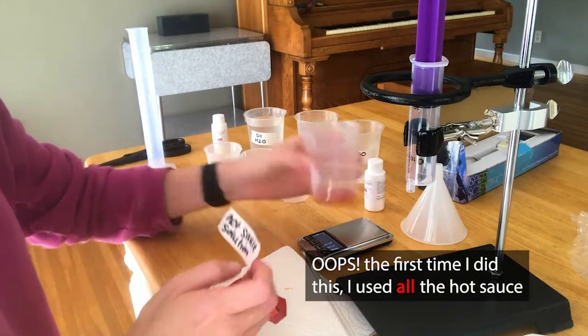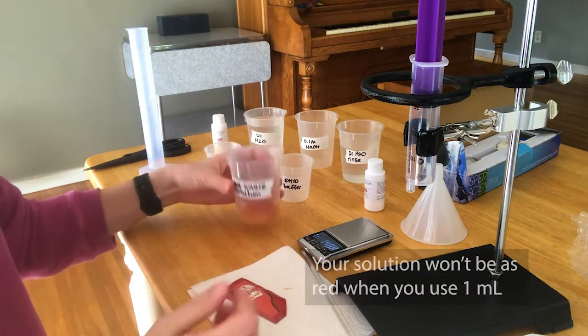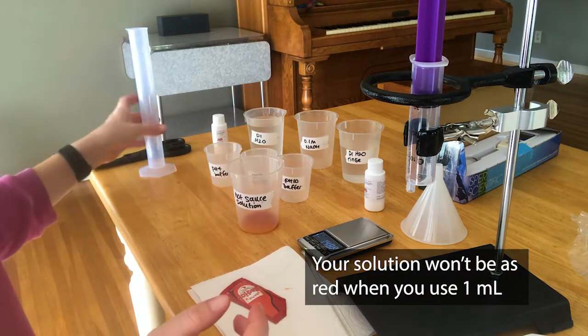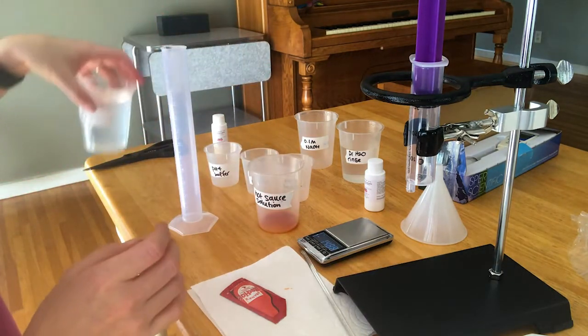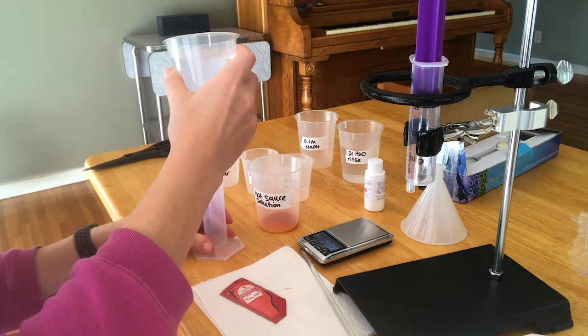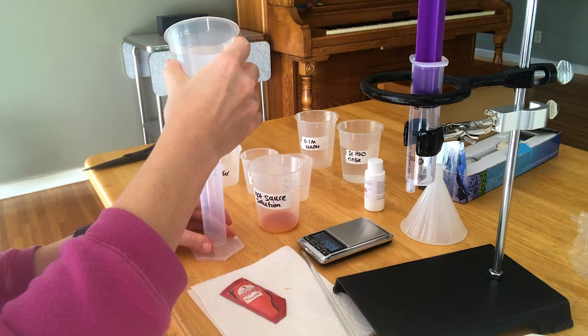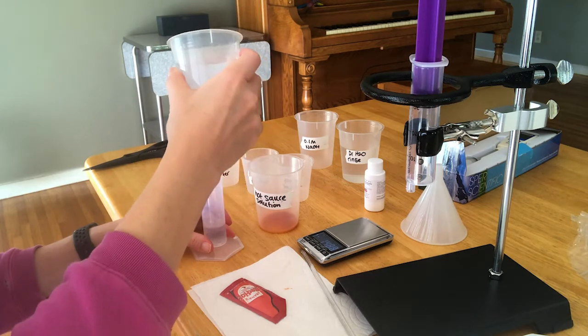The first time I did this I screwed up and put the whole hot sauce packet in the beaker, which is why it looks like there's so much in there. Make sure you only use one milliliter of hot sauce. Then you're going to add 20 milliliters of distilled water — this is a totally fresh beaker of distilled water, not my rinsing solution. It doesn't need to be exact, but close to 20 milliliters.